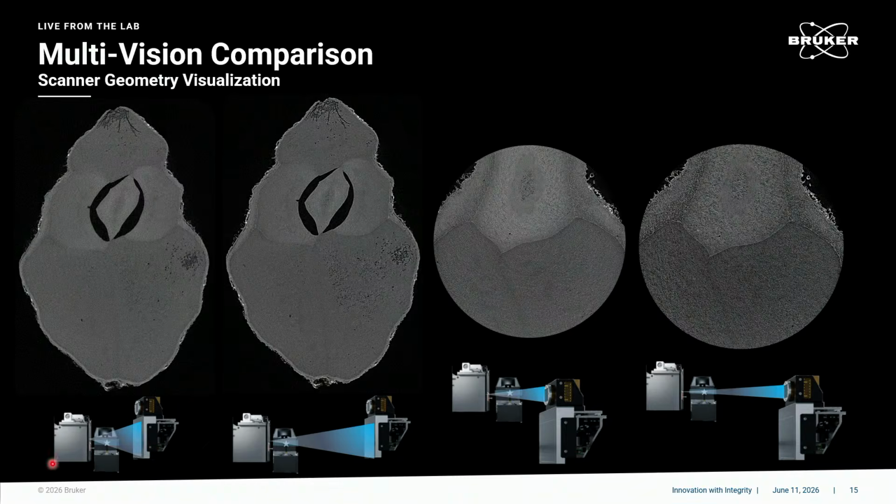In this configuration, the sample is as close as possible, and then we move the detector up as close as possible. So you can see our source to detector distance is much smaller than in this instance, where the source to detector distance is as far as possible, and your sample moves back a little bit. And it's the same for the CMOS, so close and then far.